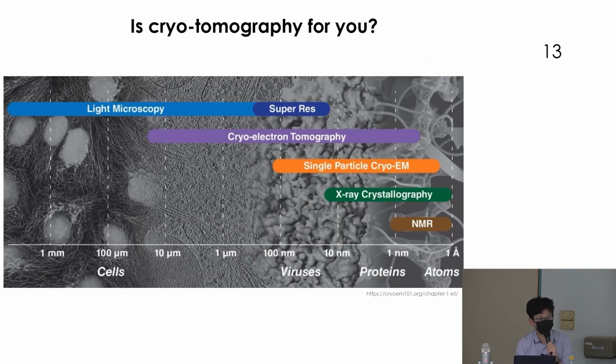So now it looks very fancy, but is cryotomography the right tool for you? It really depends on your project. There's nothing 100% good or 100% bad. If you look here, we have the light microscope, cryotomography, single particle cryo-EM, X-ray crystallography, NMR. These tools reach different resolutions, and also see different things, from atoms, proteins, viruses, to the cell. They all have different applications, different optical ranges.